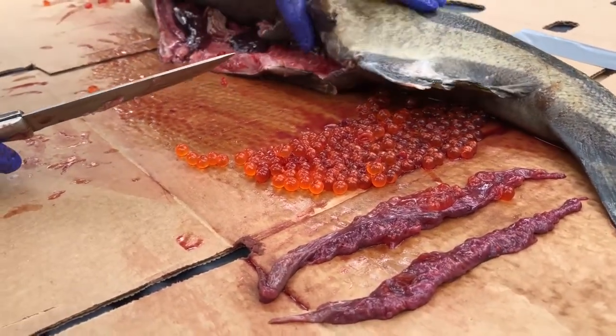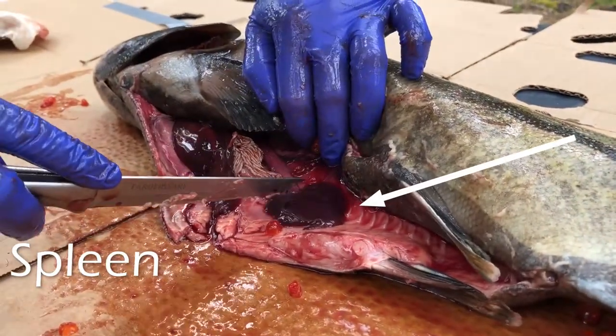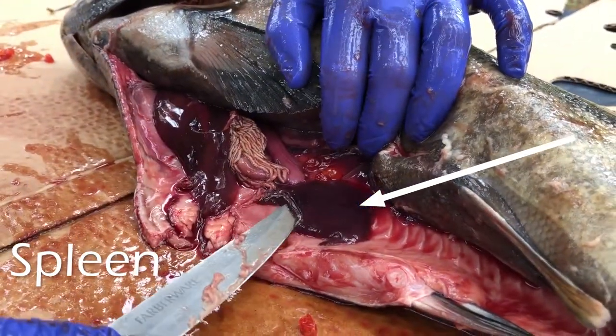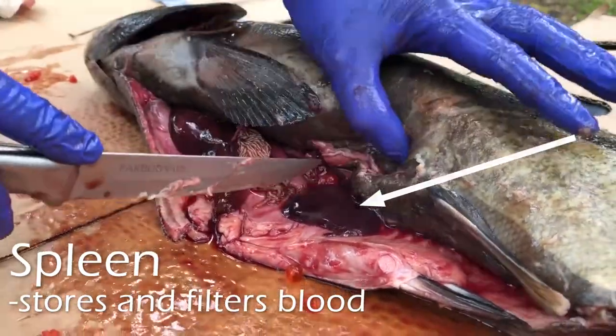Now that I've got the ovaries out of the way, I can see I have the spleen right here. It is very dark red because it's full of blood, and its job is to store and filter blood.